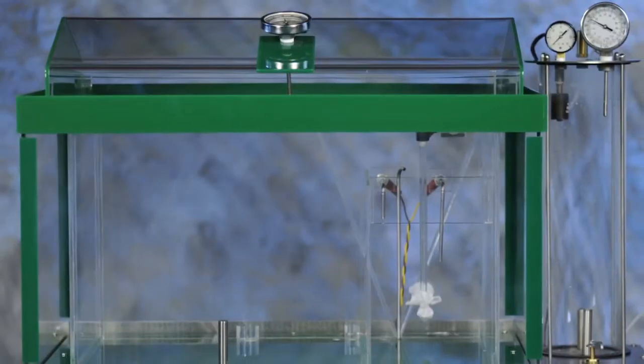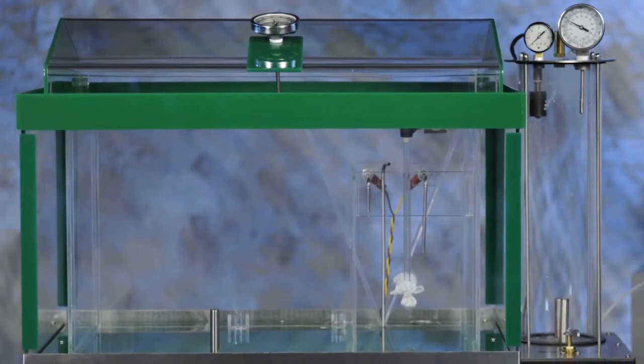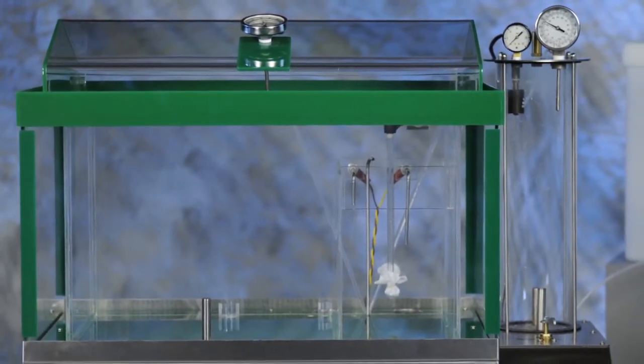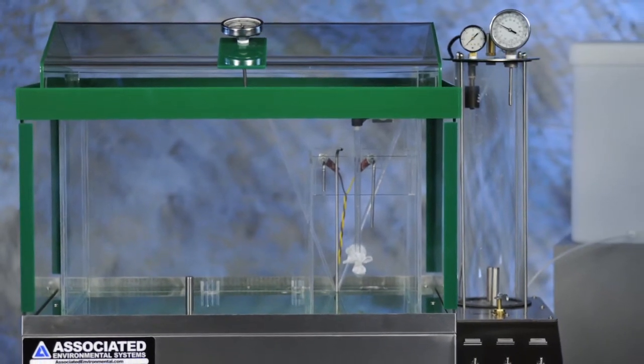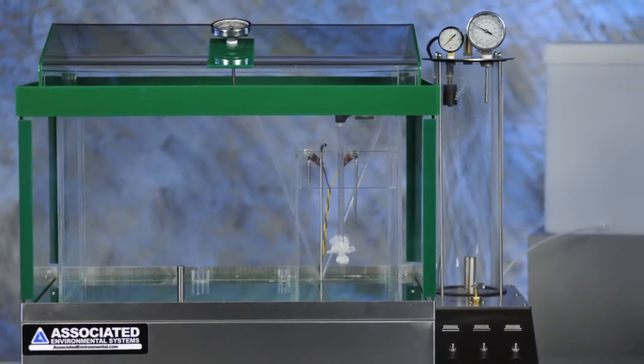MX series chambers are constructed from clear lucite sheeting. It's pretty durable for testing environments, but can be damaged during shipping. Inspect the chambers for cracks. Even small cracks will spread over time, so be sure to contact AES immediately if you find any signs of shipping damage.